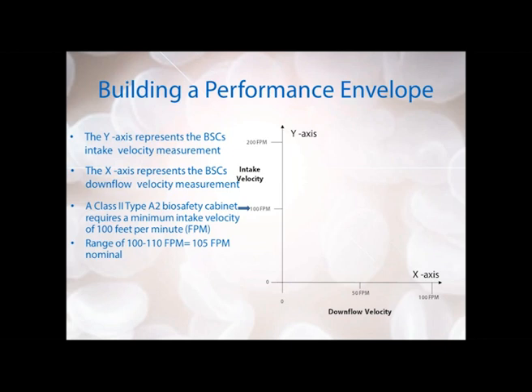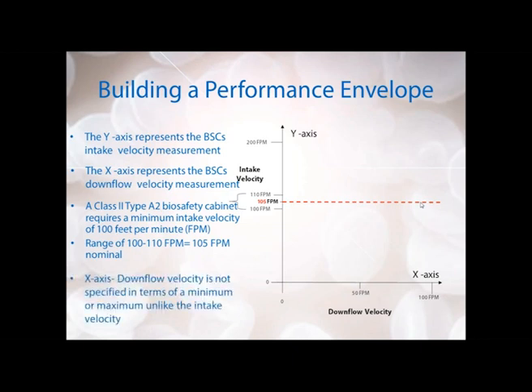That way, if there's any fluctuation in the instrumentation measurement of your inflow intake, it will not ever be below 100 feet per minute. So we have our acceptable range of 100 to 110 feet per minute, with 105 feet per minute being the nominal set point. The downflow velocity is not specified in terms of a minimum or maximum like the intake air — this is dependent on whatever the company decides works best for their cabinet. They should let you know what the downflow velocity set point is. For example, we have it set here at 50 feet per minute.